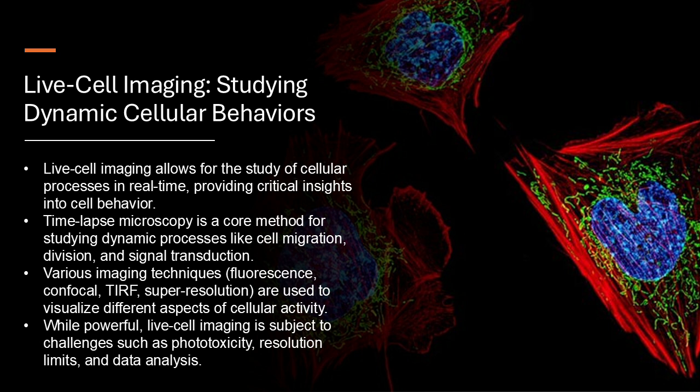And then we have fluorescent dyes, which can be used to stain specific structures within the cell, like the cell membrane or the nucleus. This lets us visualize the architecture and the organization of the cell in stunning detail. So we've got time-lapse microscopy to capture the movement, fluorescence microscopy to light up the scene. But I have a feeling we're just scratching the surface here. What other tools are researchers using to delve even deeper into this cellular world?